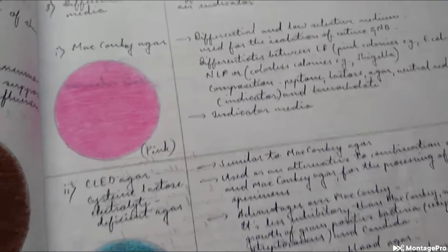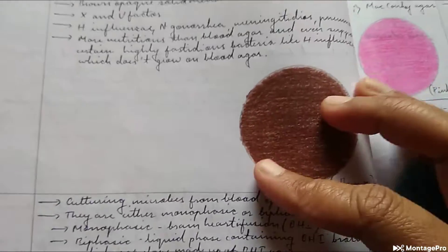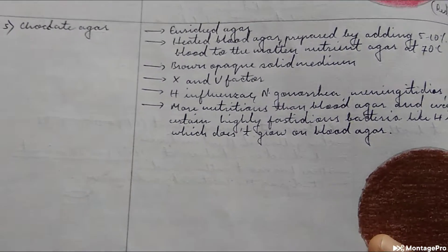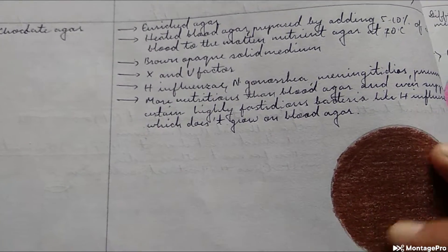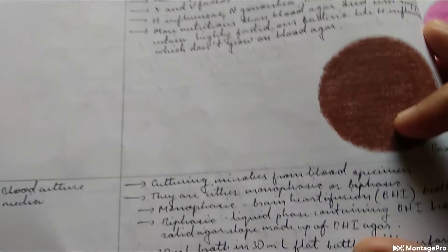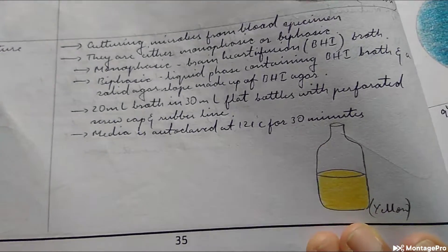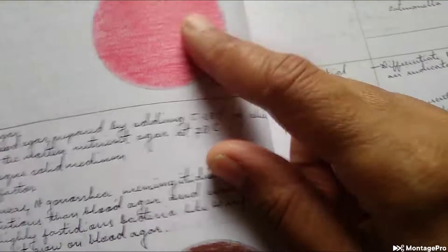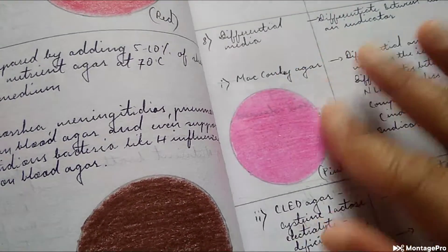Culture media - let's look at all the culture media. Look at these beautiful circles. This is chocolate agar, but it's not actually chocolate, it's blood that is heated. So it's heated blood agar and it will become like this because of hemolysis. What is this? Liquid culture, blood culture media.